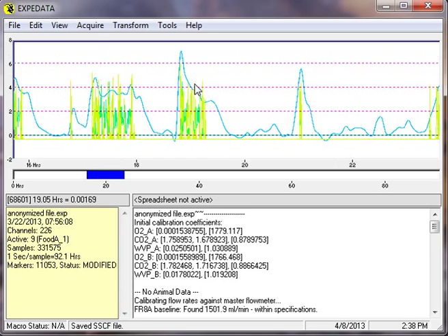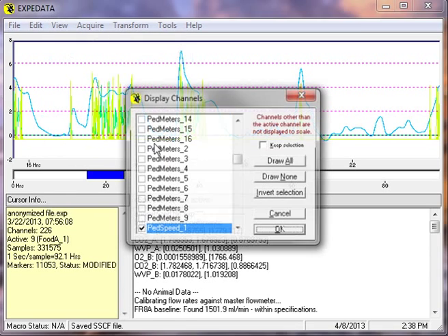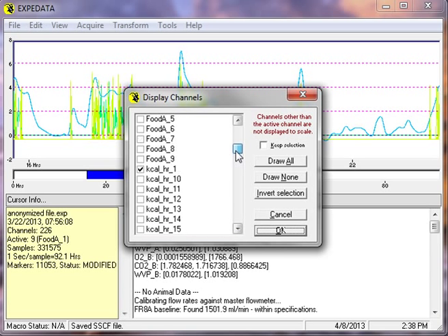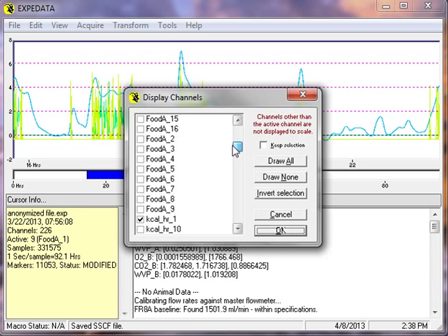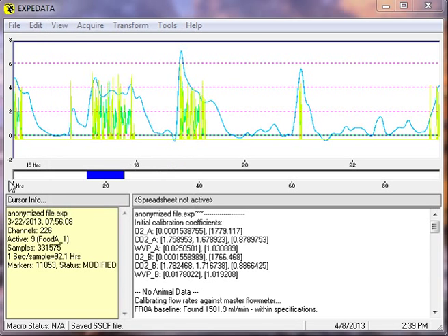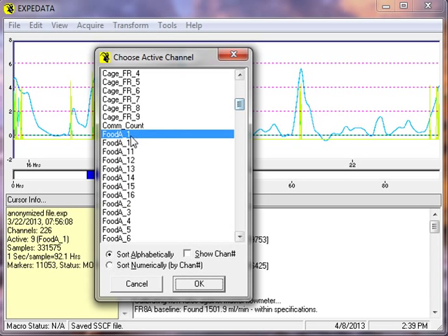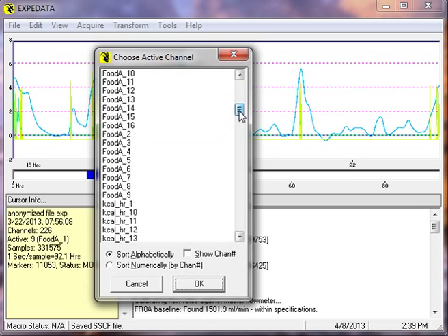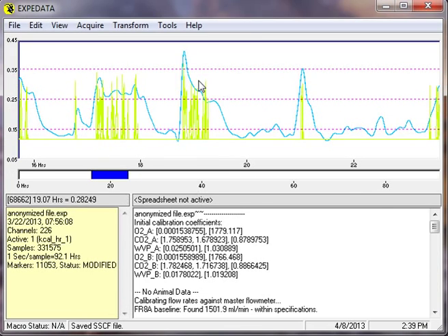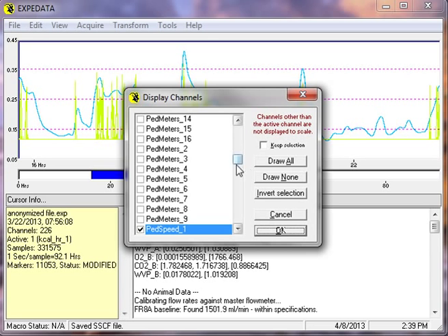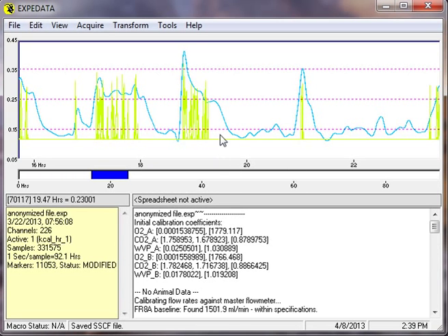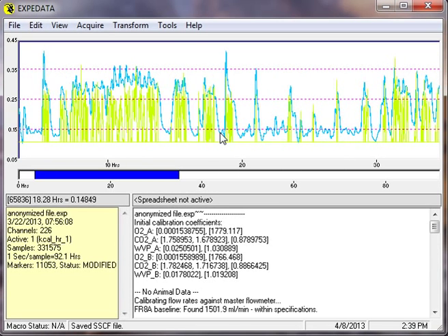Now, if you want to explore this for other mice, you can do so quite easily. Right now, I've only got the feeding data for this one mouse. But let's go ahead and turn that feeding information off. Which means I just need to go to the active channel for food. And instead of going to food, we're going to go to kilocalories per hour. Make sure that nothing else is displayed.